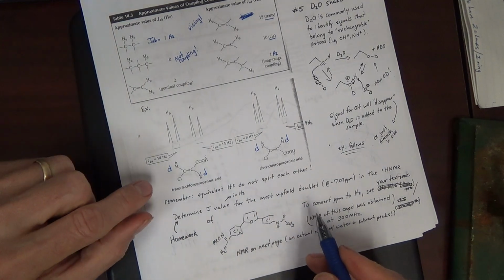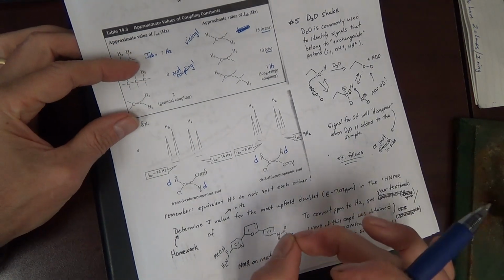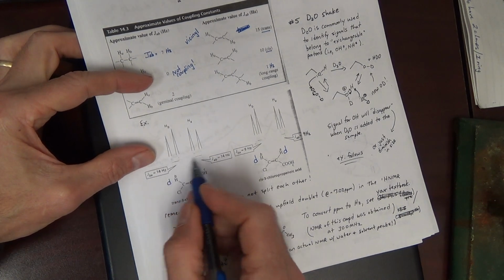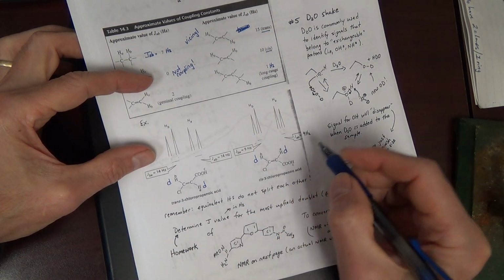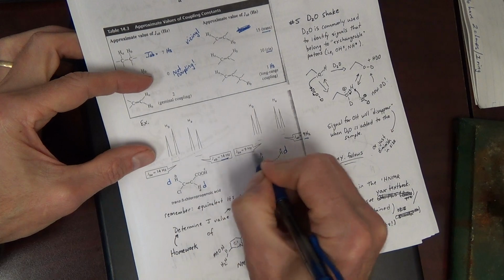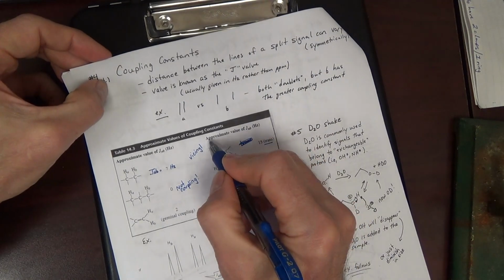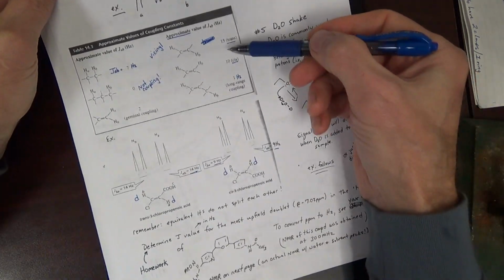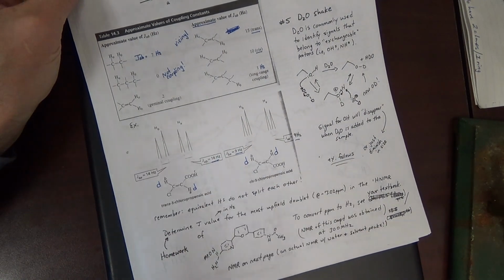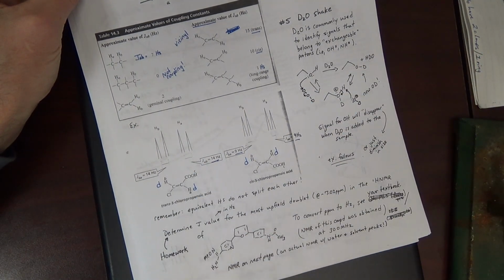The difference in these two compounds, though, is when the H's are trans, the coupling, or the distance between the lines of your doublet, will be greater. And here it's 14 Hertz, where when they're cis, it's going to be less than that, and here they're 9 Hertz. Now these 15 and 10 were approximate, okay? In this real life example, we have 14 versus 9. So the coupling constants can help you assign compound.